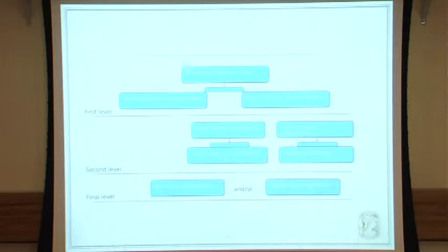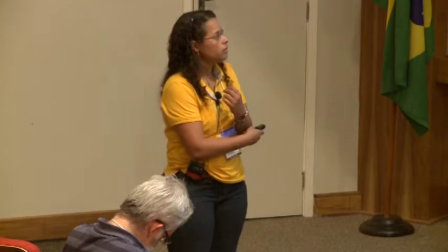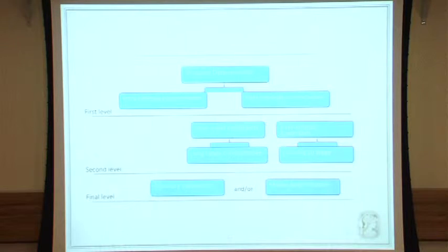So in principle, to solve the structure, you need to get intra-residual connectivities and inter-residual connectivities. This you can do by applying a carbon-carbon correlation. You can go to a second level. You can have inter-sheet constraints, inter-strand constraints, long-range connectivities, and you can use several labeling approaches to get that. The final level, I'd say, is the calculation. You can spend a lot of time during this period. Several software packages have been developed. I used to use ARIA, which has a platform connected to CCPN so you can work together and get the structure. Or, of course, you can get the model. You'll be dependent on your data.